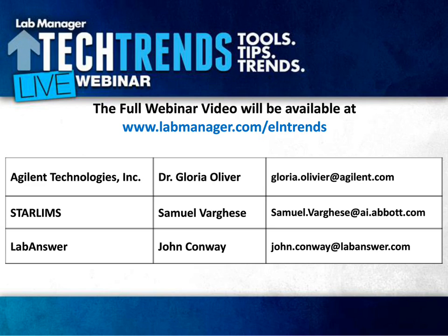Great, thank you. Now, can ELNs typically only be used with LIMS software from the same companies, or are they able to integrate with other systems easily? Sam, maybe I'll start you off with that. Yeah, so certainly I know there are ELNs that are standalone and have been built to integrate with other LIMS.